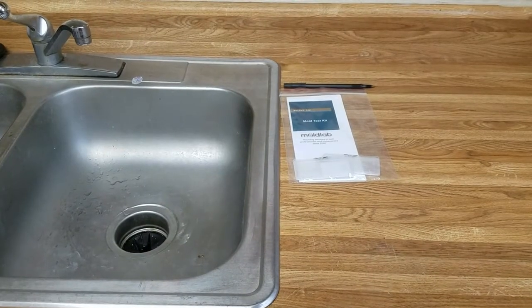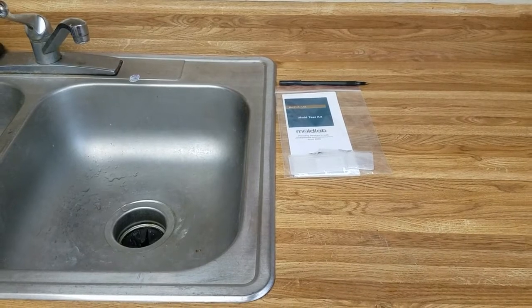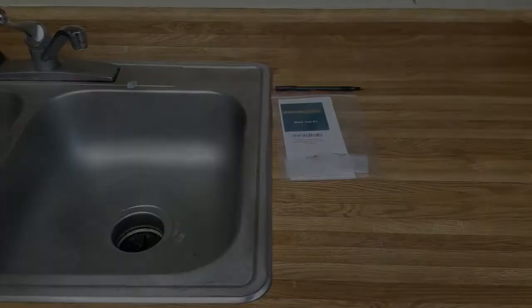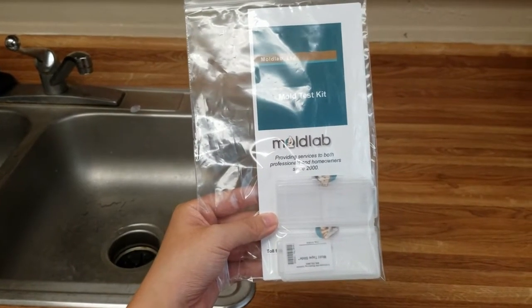Hello, my name is Jean from The Mold Lab. Today I'll be showing you how to take mold samples using our tape lift test kit, which we also call a surface test kit. Here is what our tape lift test kit looks like — this is what you'll be getting from us.